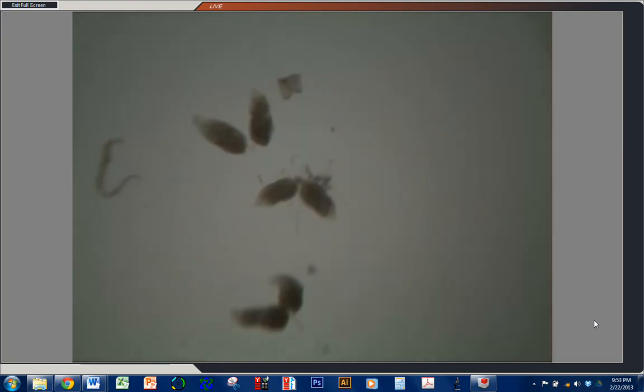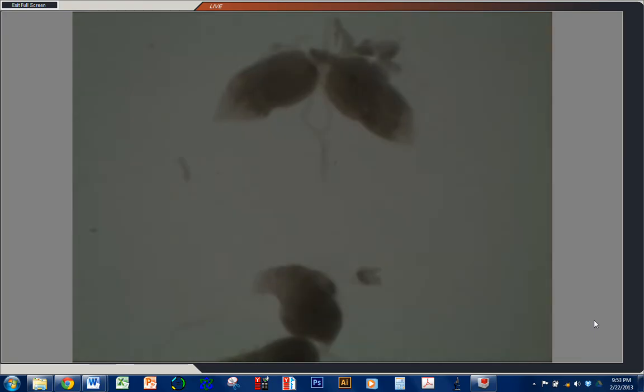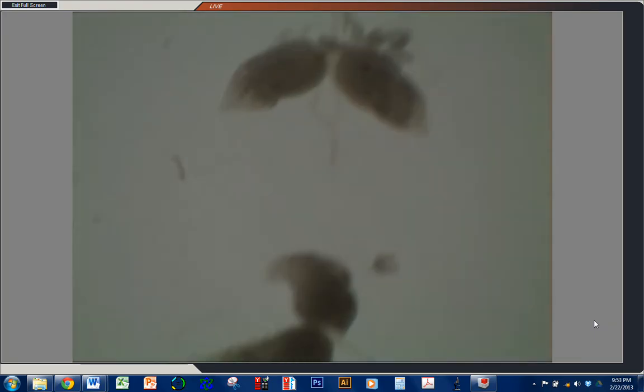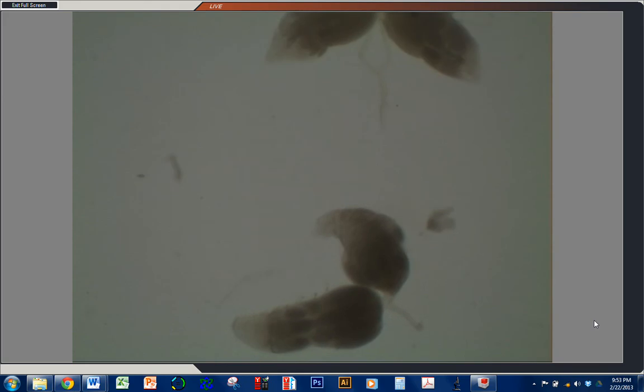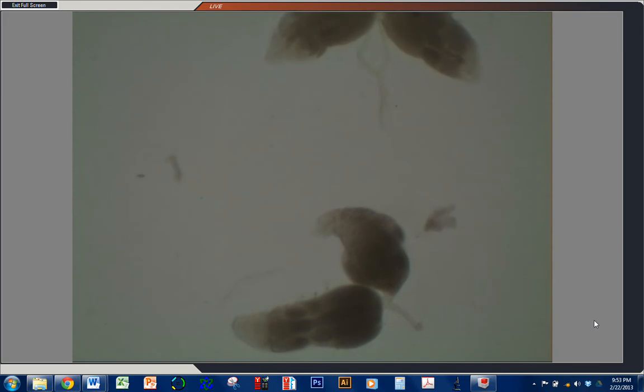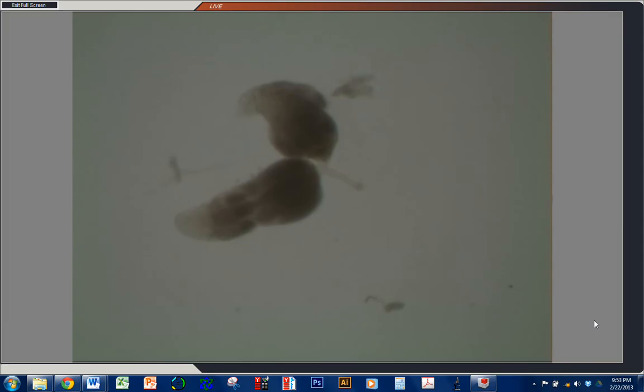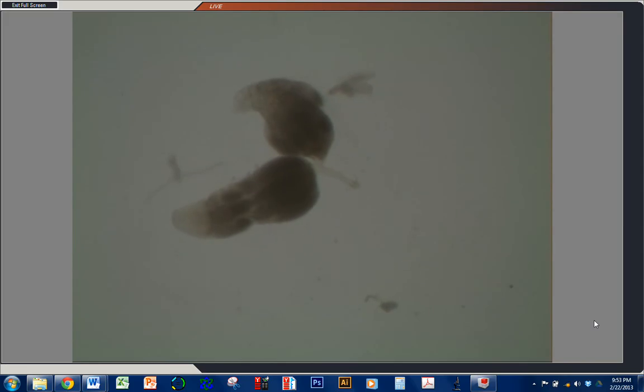And we'll zoom up a little bit here. You can see their structure. I'll focus on this pair right here. So you can see, at the anterior, they're largely translucent.